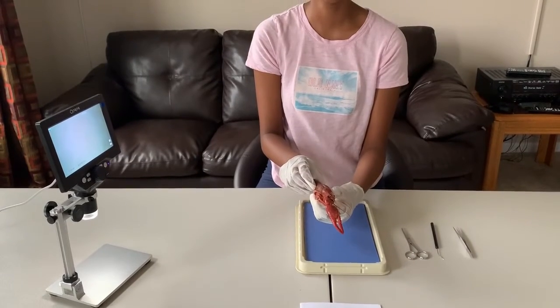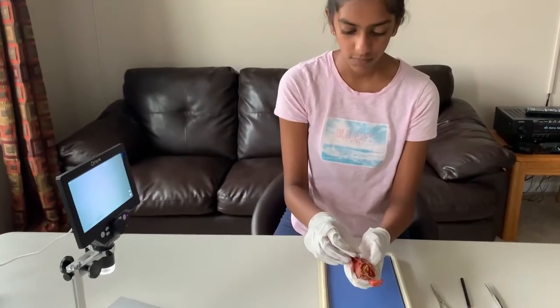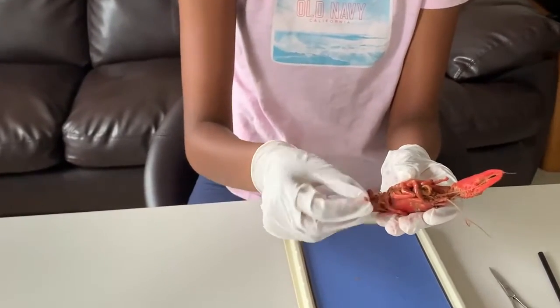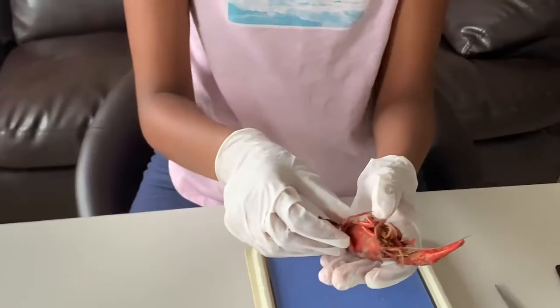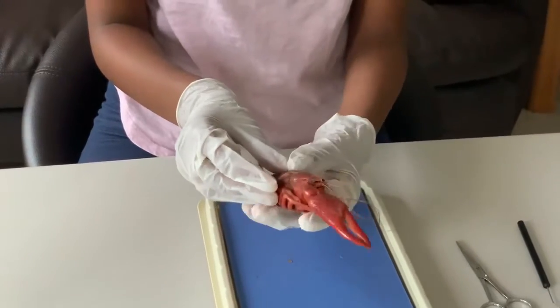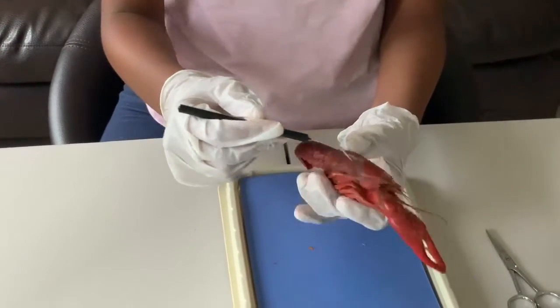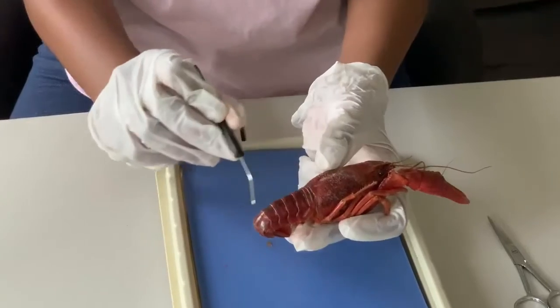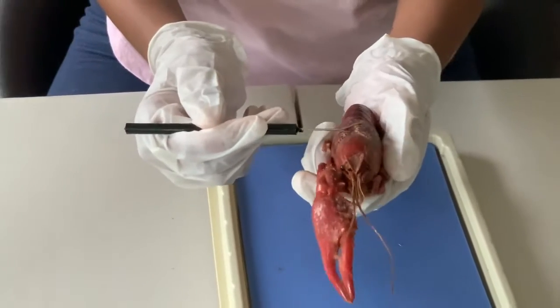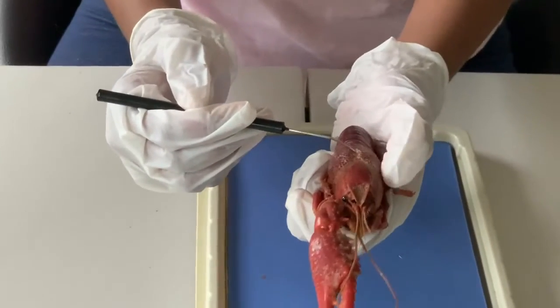Another feature of arthropods are the jointed appendages, which you can see over here. Crayfish have jointed legs — I can bend them back and forth. Another feature of arthropods are the body segments. A crayfish has a cephalothorax and an abdomen. Cephalo means head and thorax means thorax — both the head and the thorax are fused together.